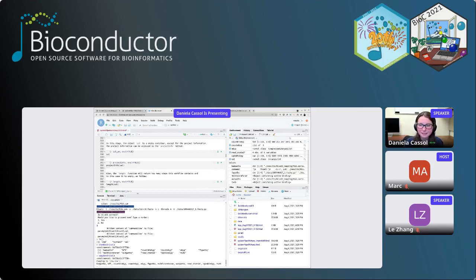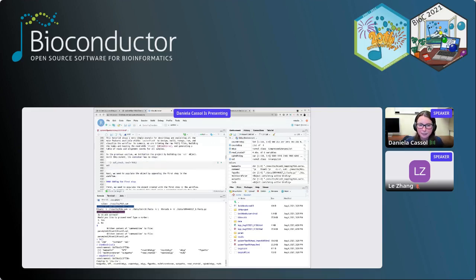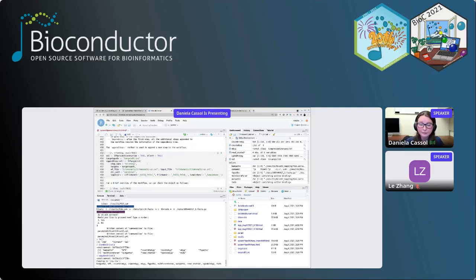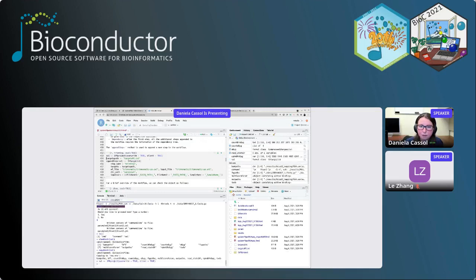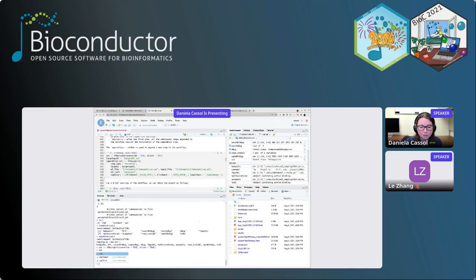Okay, so that was it from the project, the SPRproject function. To answer that question and show a little more detail about how to add more steps in interactive mode, I will go down, because there is some information about that. If you want to come here later to read all of it, jump to line 453. I will start this project from scratch, so I'll do an overwrite. Now if you check sal, it's again an empty instance of SYSargsList, and the length, as I said, is 0.